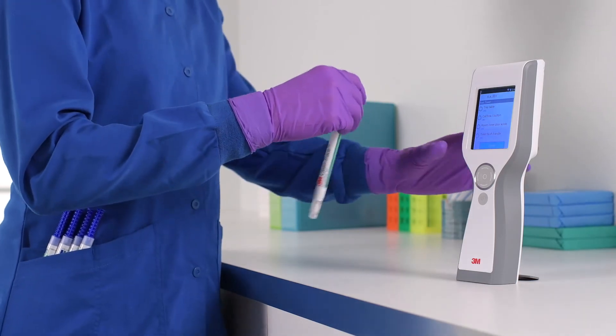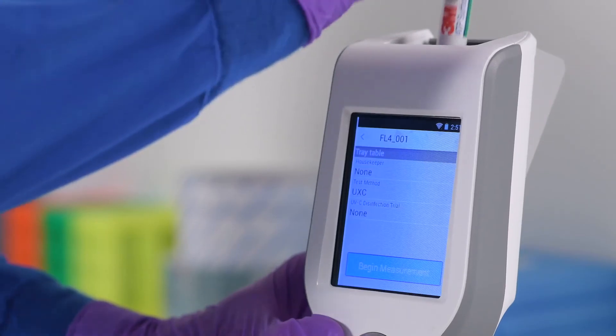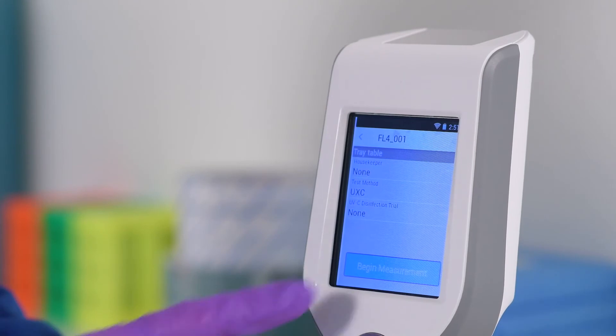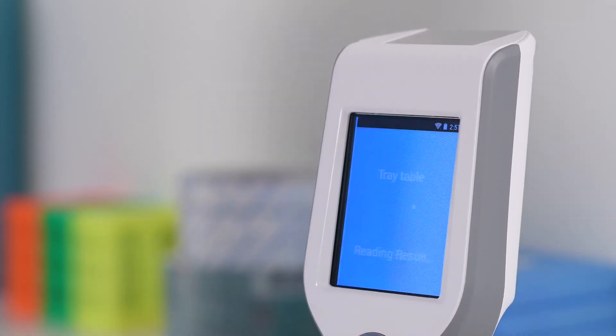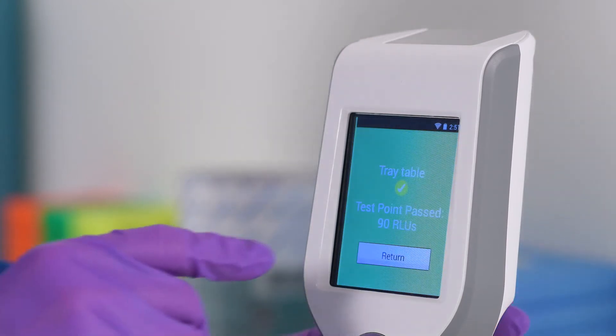Insert the test into the CleanTrace Luminometer LX25 and follow the on-screen prompts to take a measurement. In 10 seconds or less, you'll see the result, a quantitative RLU value and a pass or fail response.